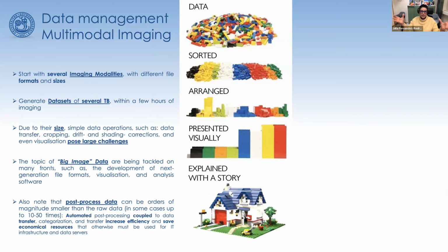Some of them are bigger and can go to terabytes, and the size makes it difficult to process or analyze, because it becomes almost impossible to transfer, crop, or shade. And of course we have the topic of big data and post-processing.